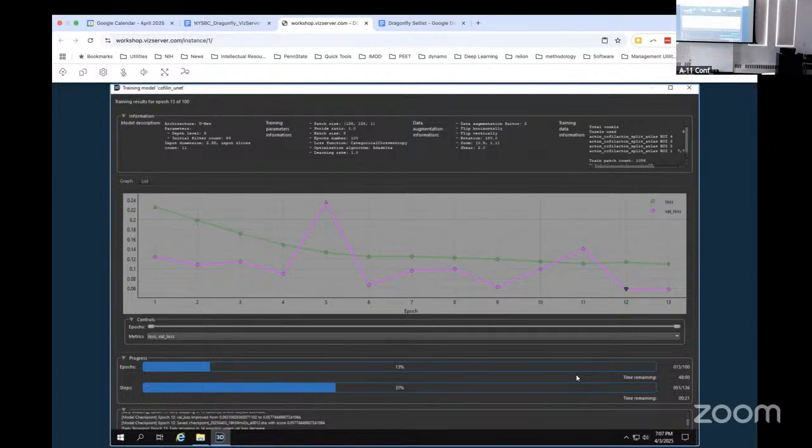Cool, and then you can certainly use those parameters, like for this, but you don't necessarily need to. Oh, okay, so even the 64 to 128. Yes. Okay, cool, so I'll just leave it at whatever.